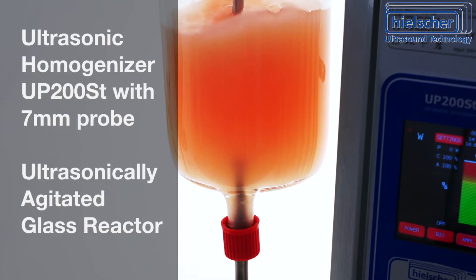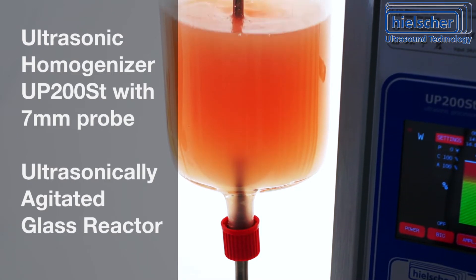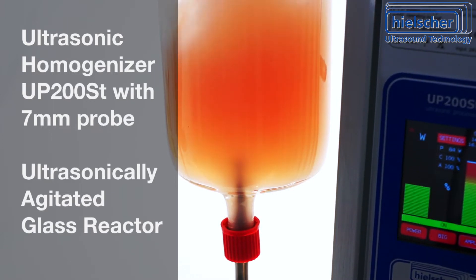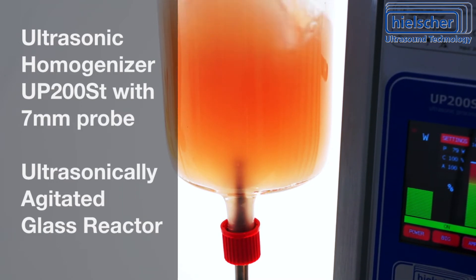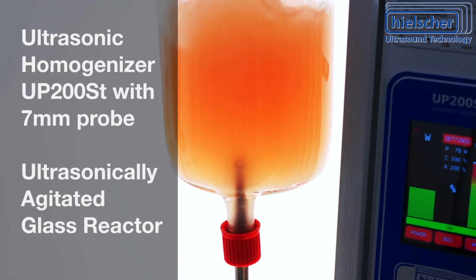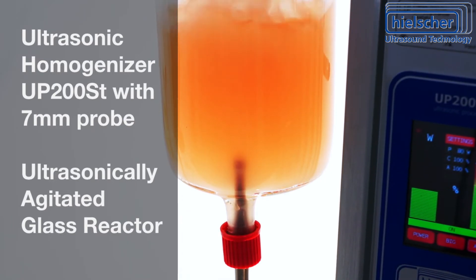In this video, a Hielscher 200W ultrasonic homogenizer UP200ST with a 7mm sonotrode is mounted to a standard glass fitting at the bottom of a glass reactor. The mounting can be horizontal, vertical, or any other direction.